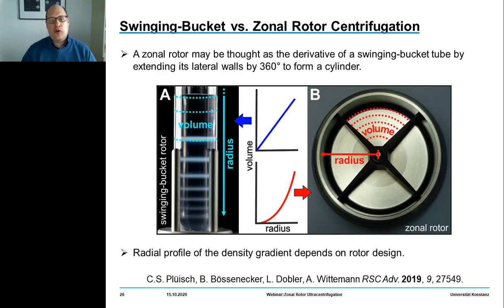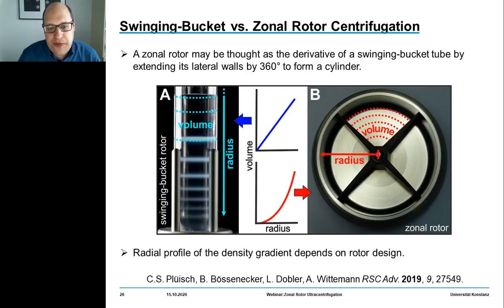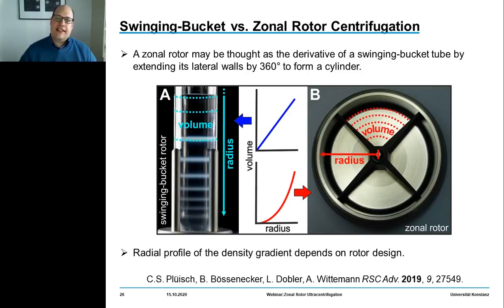Here you see a top view of a zonal rotor on the right-hand side with an inner core. This core with four vertical septa allows for compartmentalization of the rotor chamber, helping to minimize eddy flow of fluid. It also contains channels that allow selective addressing of rotor center and rotor edge, which is the prerequisite for dynamic loading.